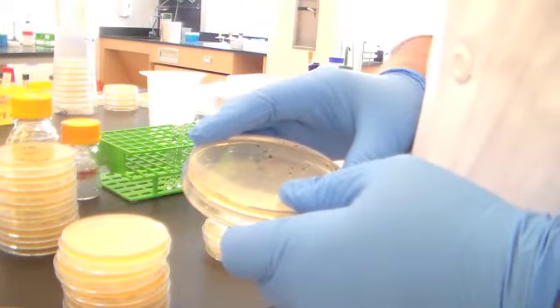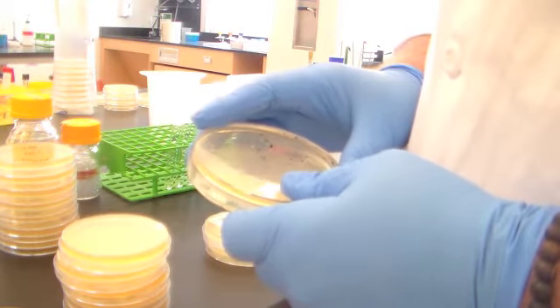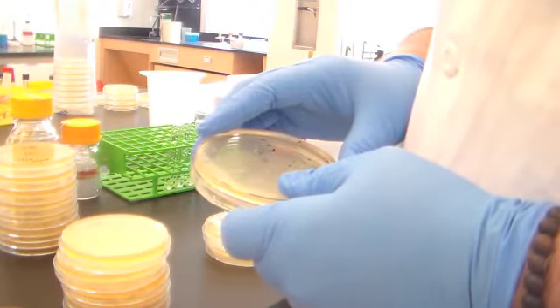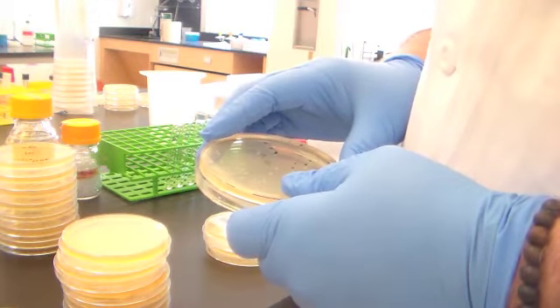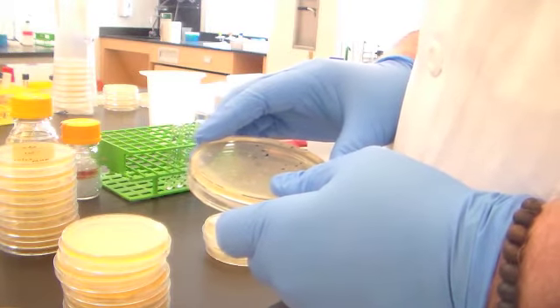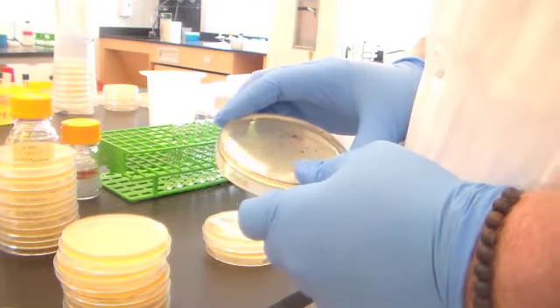And in the handout, we'll talk about how you'll do the calculation. So you can calculate the titer of your culture at that particular time point, either by using a formula or simply by logically reasoning it out. That's better described on your handout, and we'll also be talking about that in lab one-on-one.